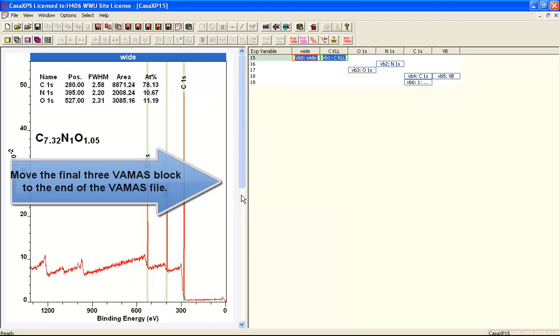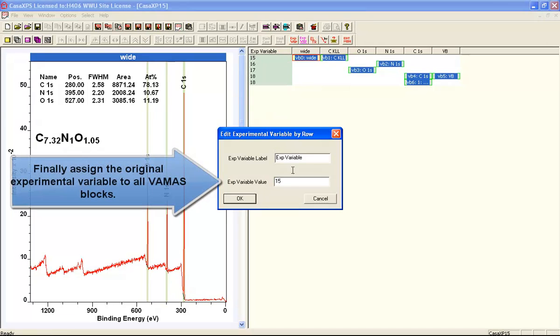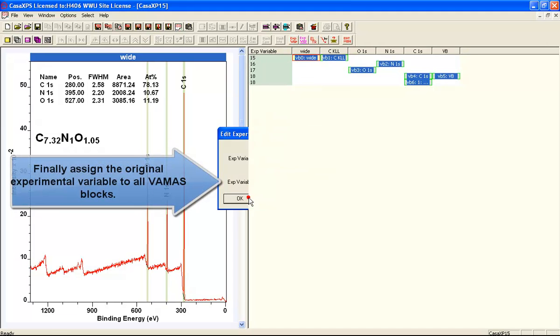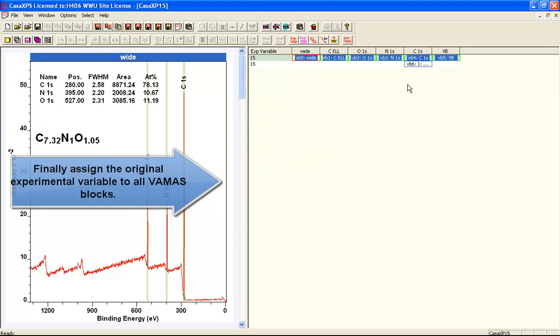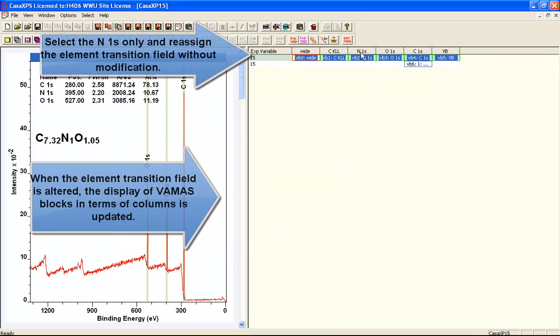Now I'm going to apply the same action to three all in one go. I've now reordered the file, and you can see by changing the element transition, the display itself is altered.